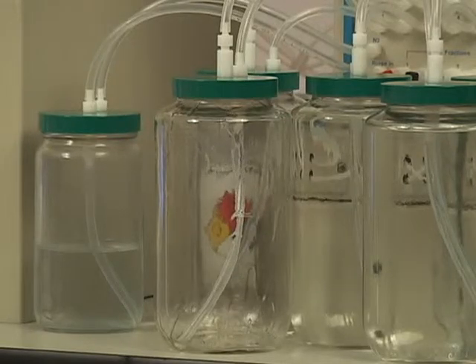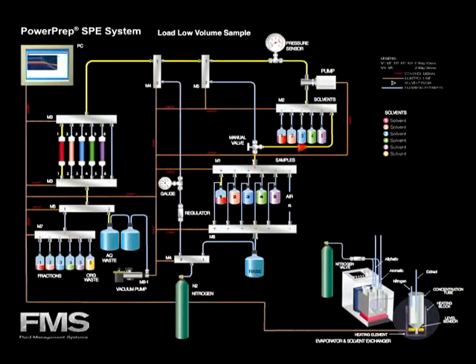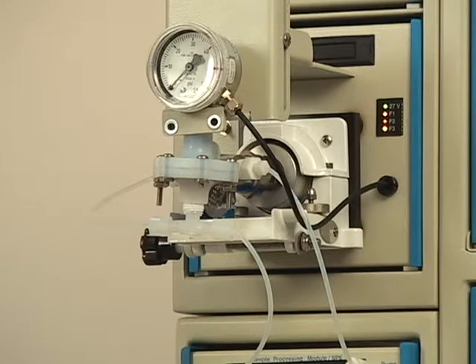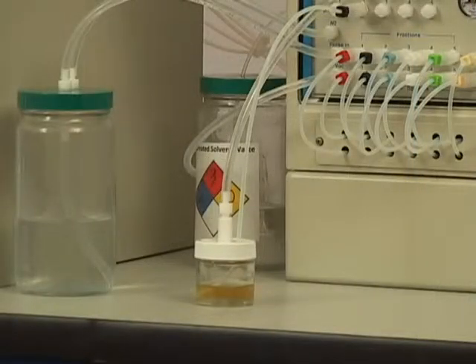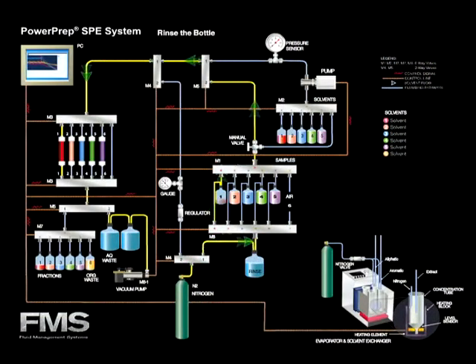The PowerPrep SPE system is also capable of loading low volume samples such as serum and milk using the positive pressure pump. In this example, a human serum sample is loaded for dioxin and PCB analysis. The human serum sample is loaded onto the SPE cartridge by the positive pressure pump at five milliliters per minute. The sample bottle is automatically rinsed.